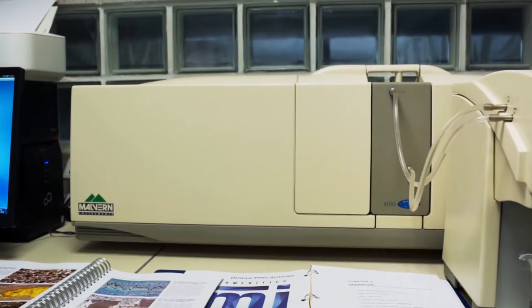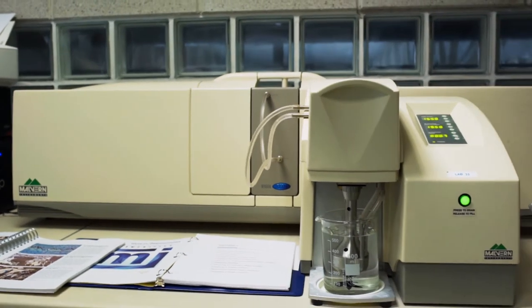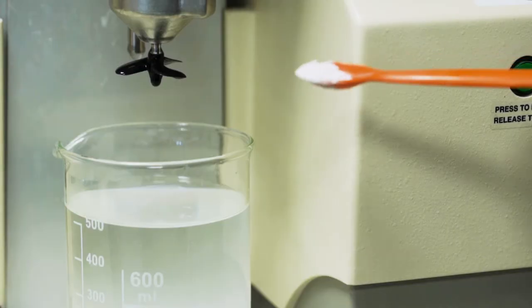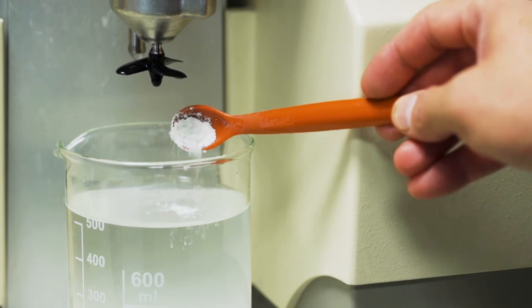The laser diffraction analysis coupled with the X-ray sedimentation technique permits one to measure the particle size distribution.